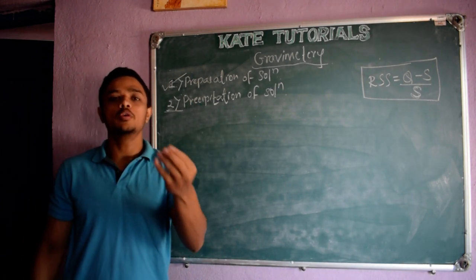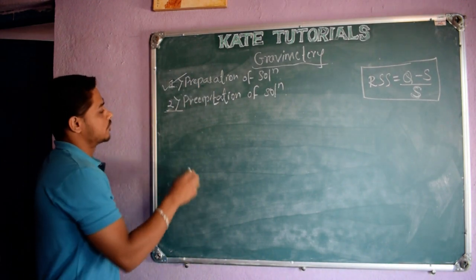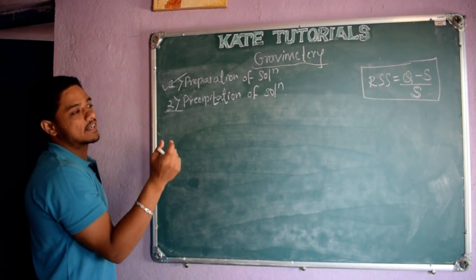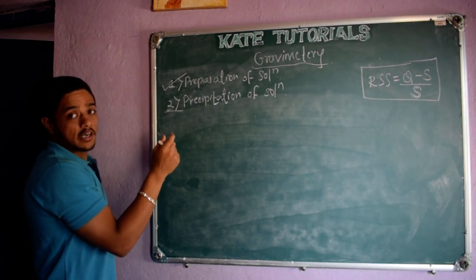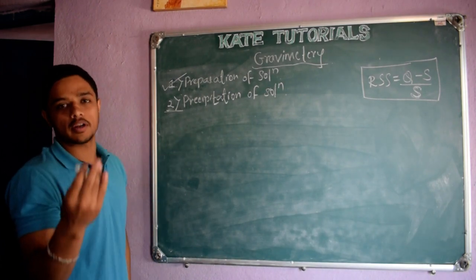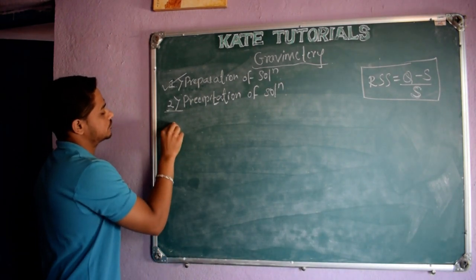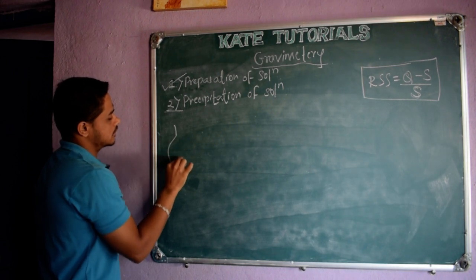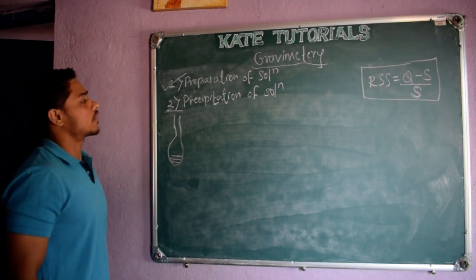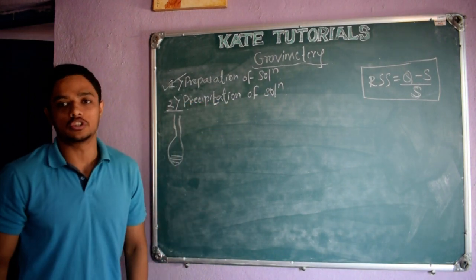How we are going to precipitate. In last class, what we did — we made that into solution. We brought that solid form or any form into solution. So, we have got here a solution. What we do is the next step: precipitation of solution.